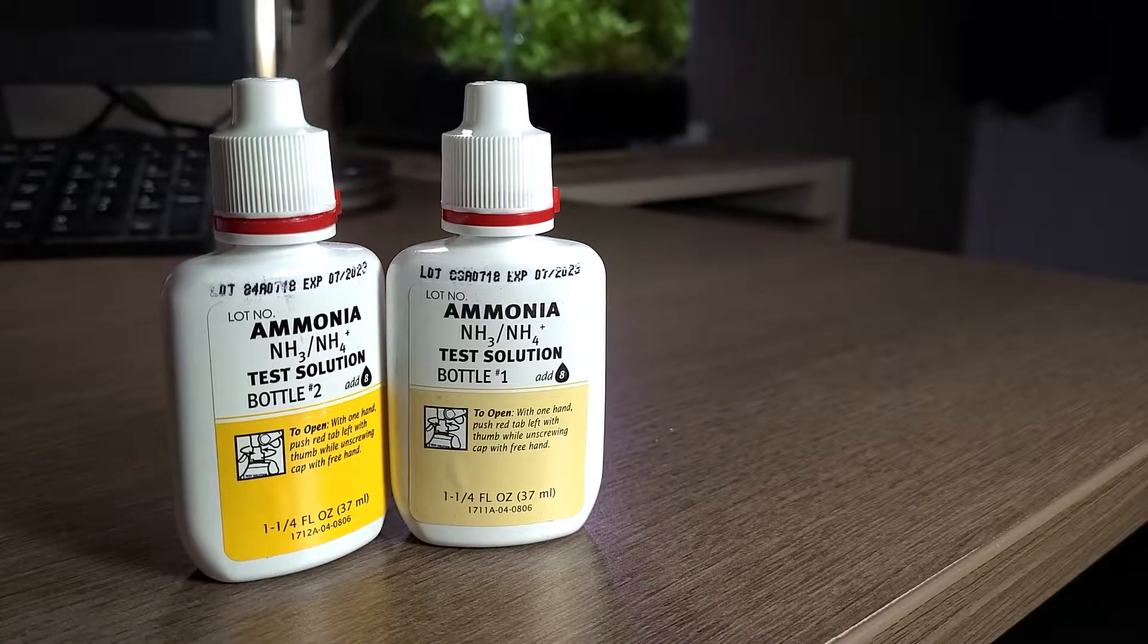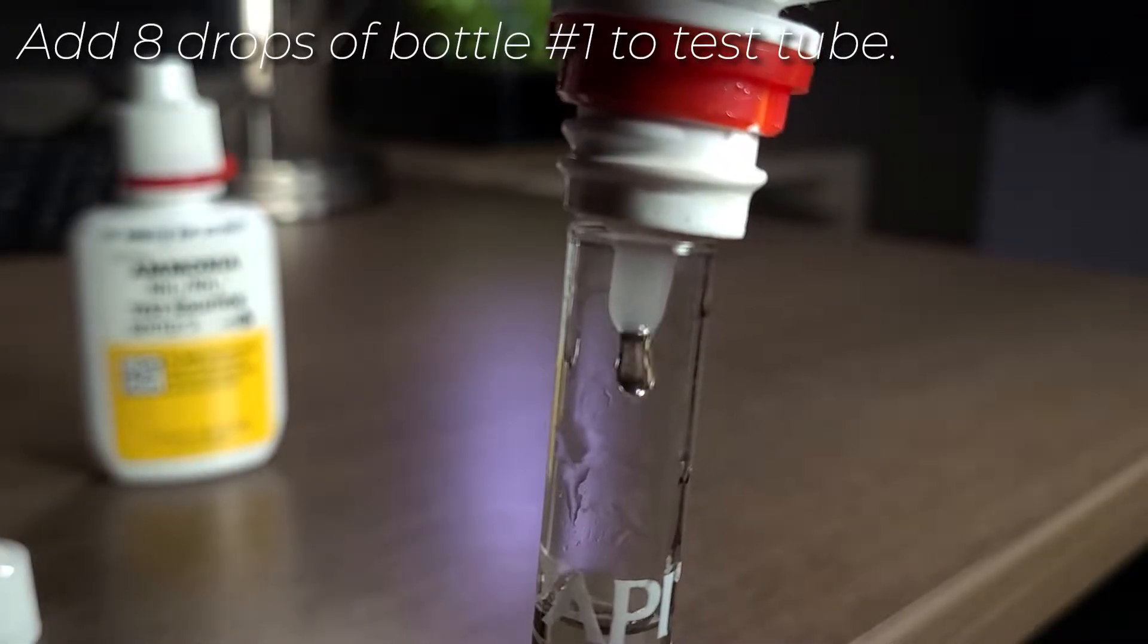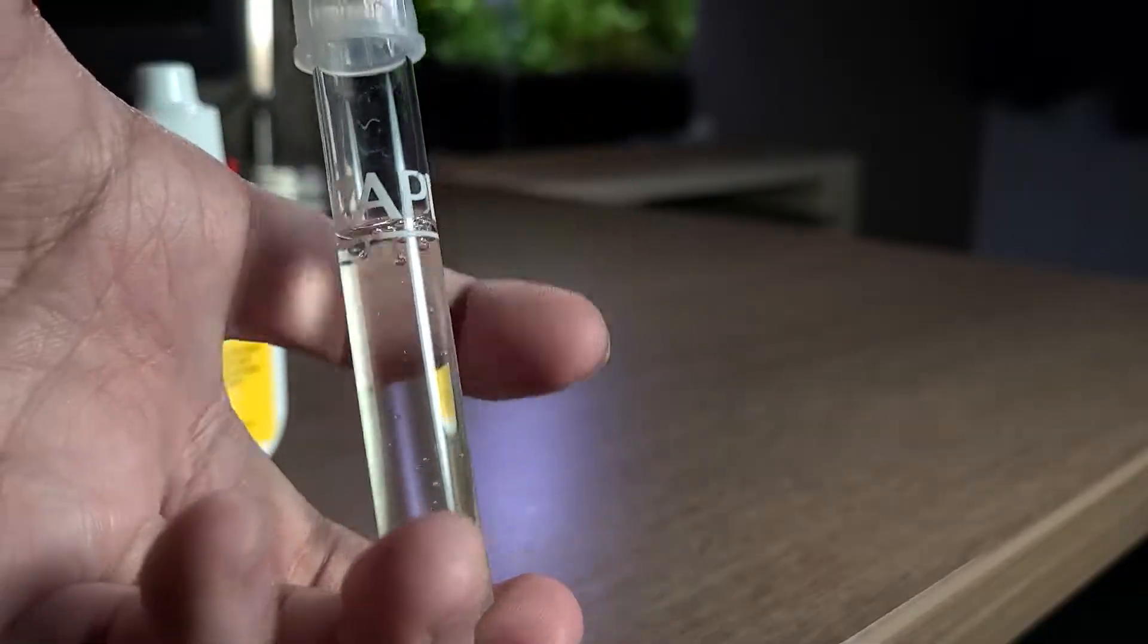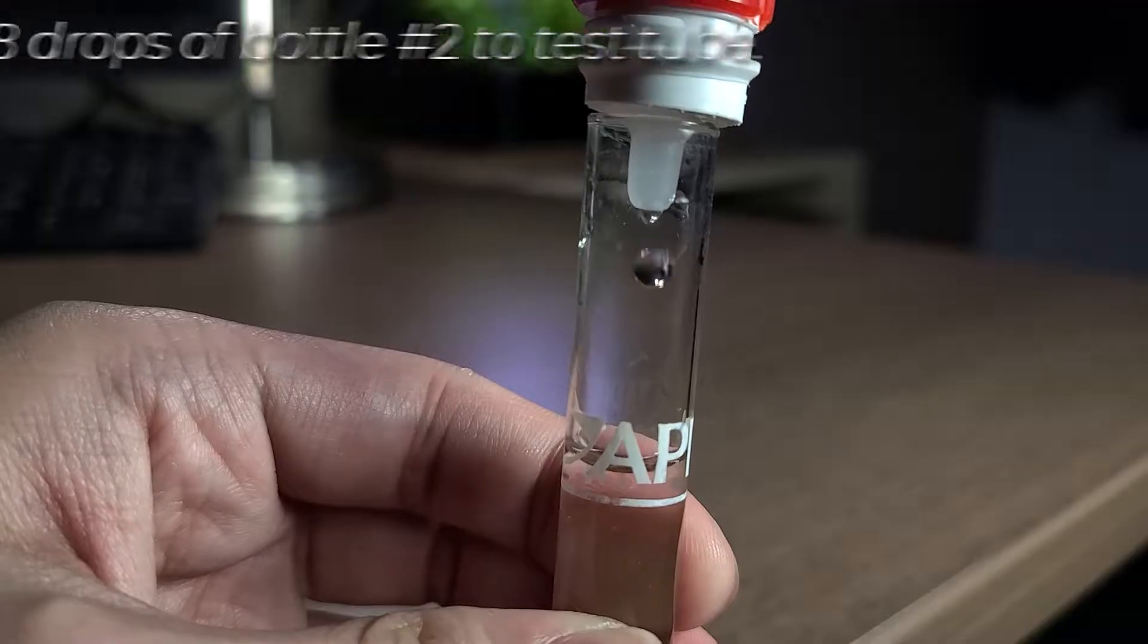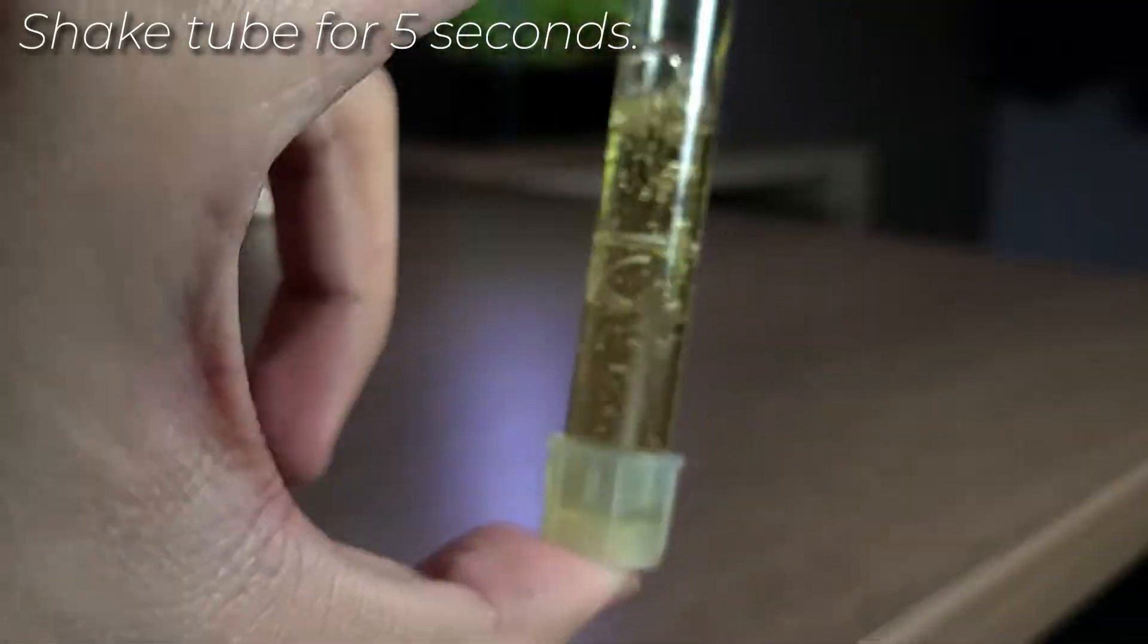For ammonia, we are given two bottles. Take the first bottle, add eight drops, and then shake to ensure uniformity of the drops. There's no need to wait, so we can add eight drops of bottle number two and then vigorously shake the tube for five seconds.